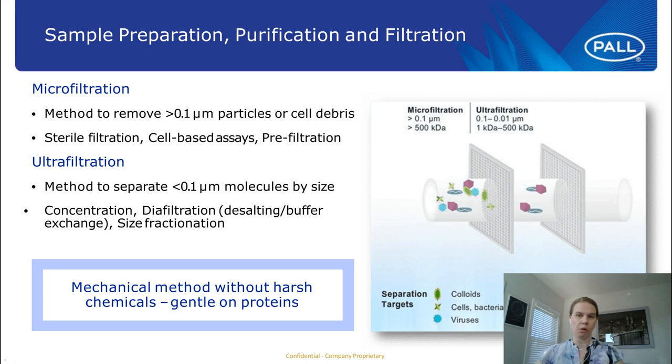Now, if we talk about ultrafiltration, we are talking about small size molecules and particulate removal or even separation. So anything that is smaller than 0.1 micron, we would be using ultrafiltration filters. And again, when we talk about ultrafiltration, we are thinking about nucleic acids and proteins. So we're talking about molecules at the molecular level.